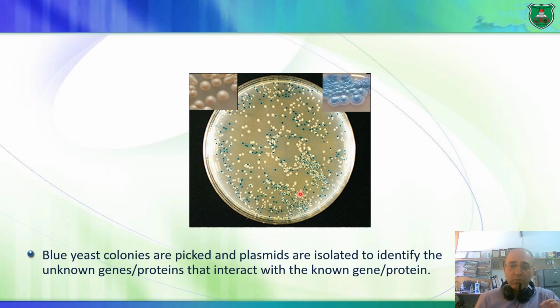What we do then is pick these colonies and grow them to expand them.